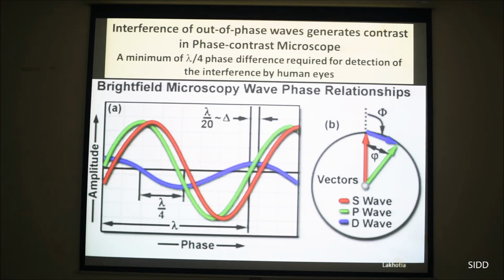Now red and green are not moving at the same time, but they are in phase because they have the same amplitude, but more than amplitude, their wavelengths are the same. The distance between 2 peaks or 2 troughs is identical, and therefore we say that these light rays are in phase. But if one of them becomes slower, then peak and trough of the two do not become synchronous, and then they will begin to show interference, and that can be destructive interference or constructive interference.